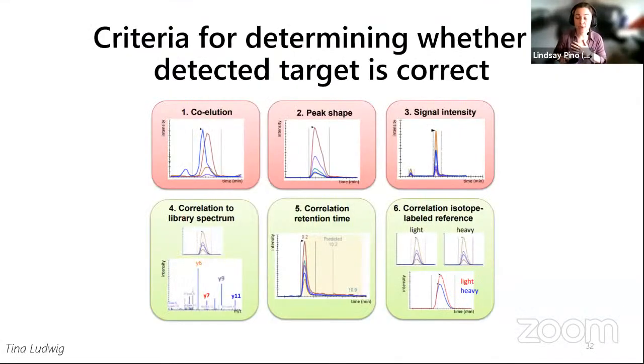So I think Juan's got the rest of those. That's kind of the characteristics that, if we were to analyze, for example, PRM by ourselves, by eye, it's doing the exact same things that these software programs are doing, and the software is just automating a lot of this.